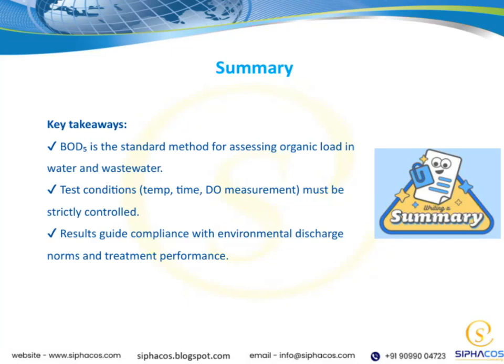Let's wrap up with some key takeaways. First, BOD5 remains the standard method for assessing the organic load in both water and wastewater. It's a reliable way to gauge how much biodegradable material is present. Next, it's crucial to remember that the test conditions, such as temperature, incubation time, and dissolved oxygen measurement, must be strictly controlled. Any deviation can lead to inaccurate results, which could impact your treatment decisions. Finally, these results are essential for ensuring compliance with environmental discharge norms and for evaluating how well your treatment processes are performing. Keeping these points in mind helps us better understand and manage water quality effectively.